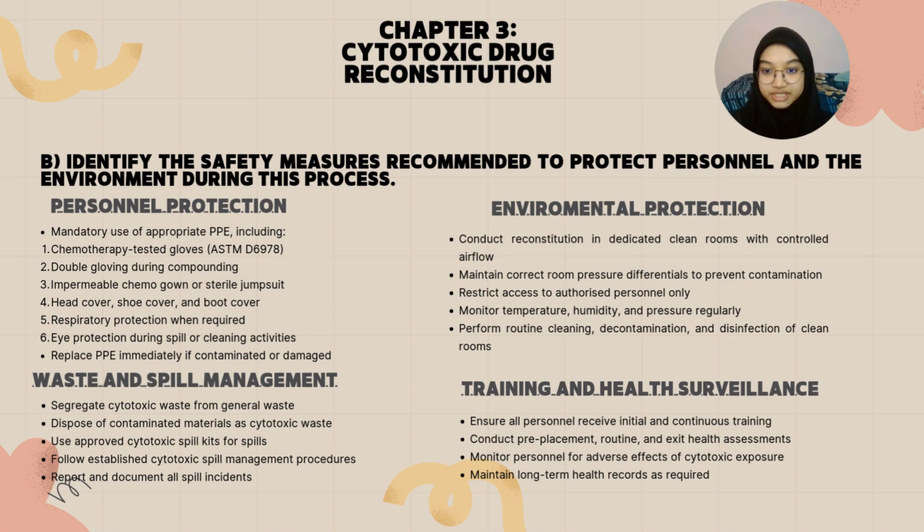For environmental protection, cytotoxic drug reconstitution occurs in dedicated clean rooms to prevent contamination and exposure.